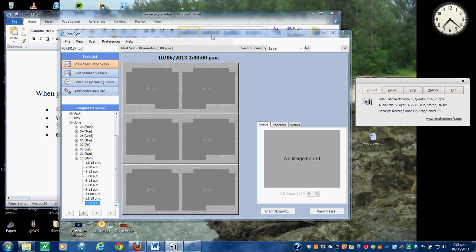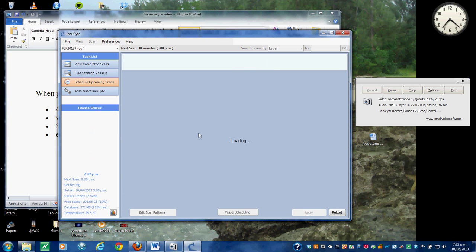Okay, so welcome to Henry's SOP for the IncuCyte software. So I'm going to start with scheduling an upcoming scan.